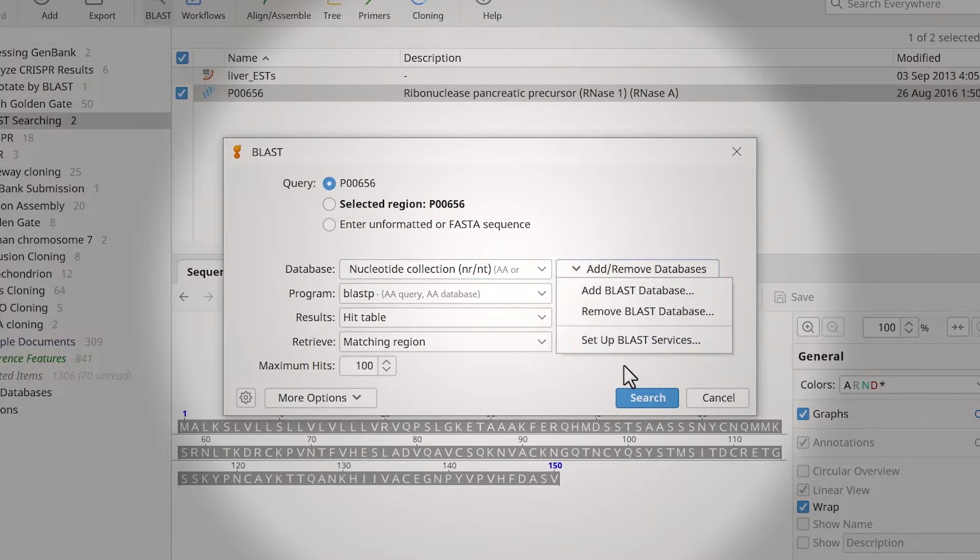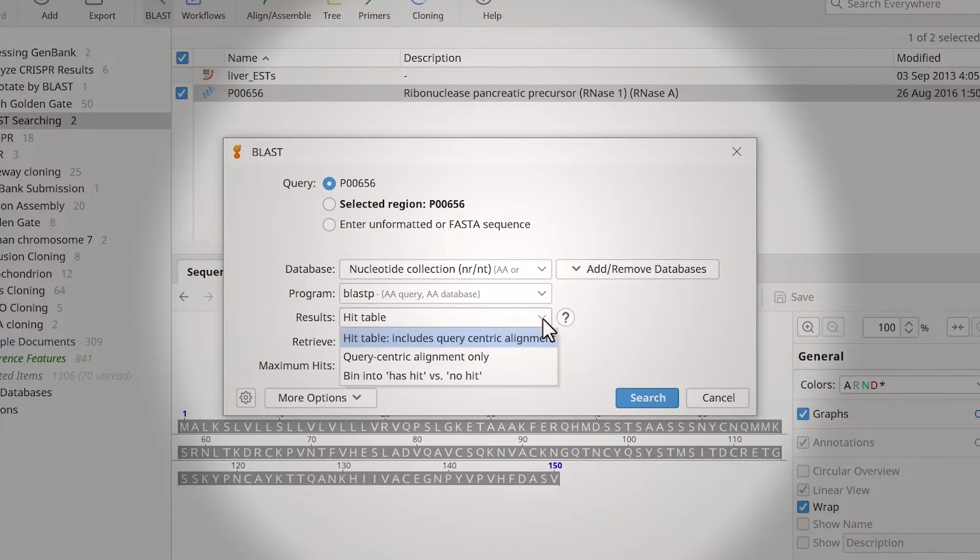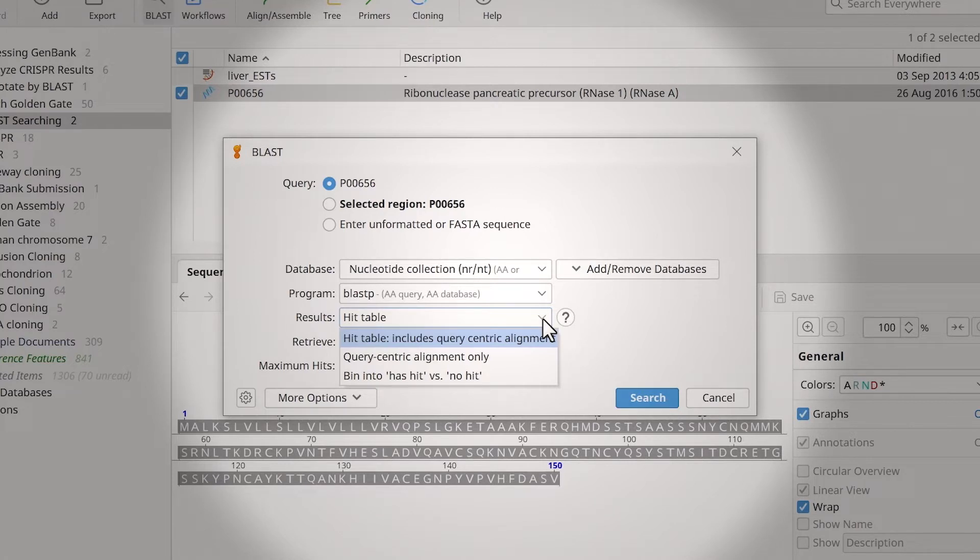The program type will determine how BLAST compares the input sequence to the database. For the BLAST search results, it's possible to have them in a hit table, which also includes a viewable query-centric alignment. This option is suitable for less than 100 queries.